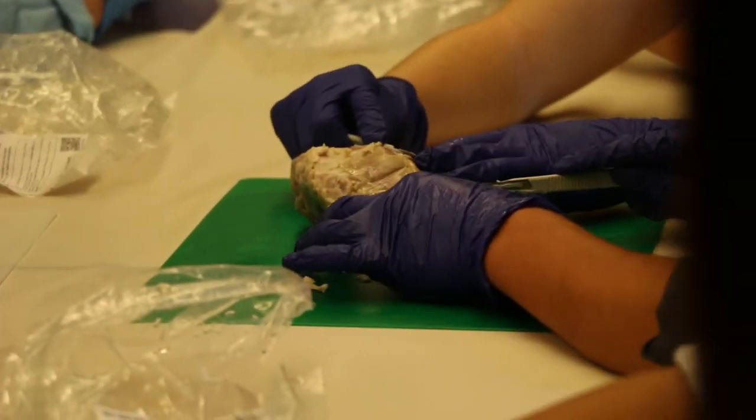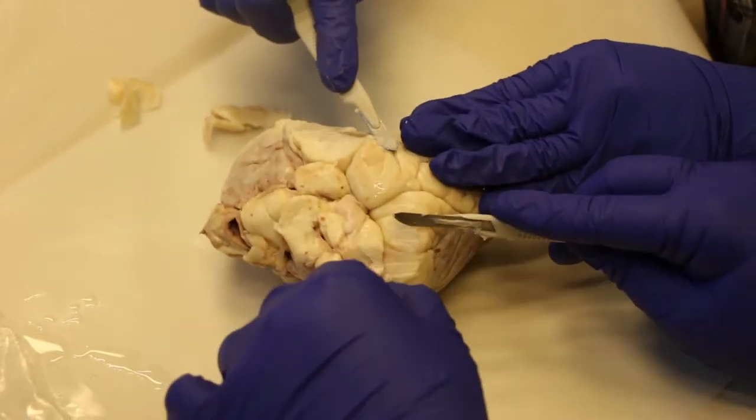First, my group started out with the heart dissection and we got to cut it open and see all the structure. It was super cool. We got to cut where we wanted to with our partner, which was pretty exciting — like a bonding moment.